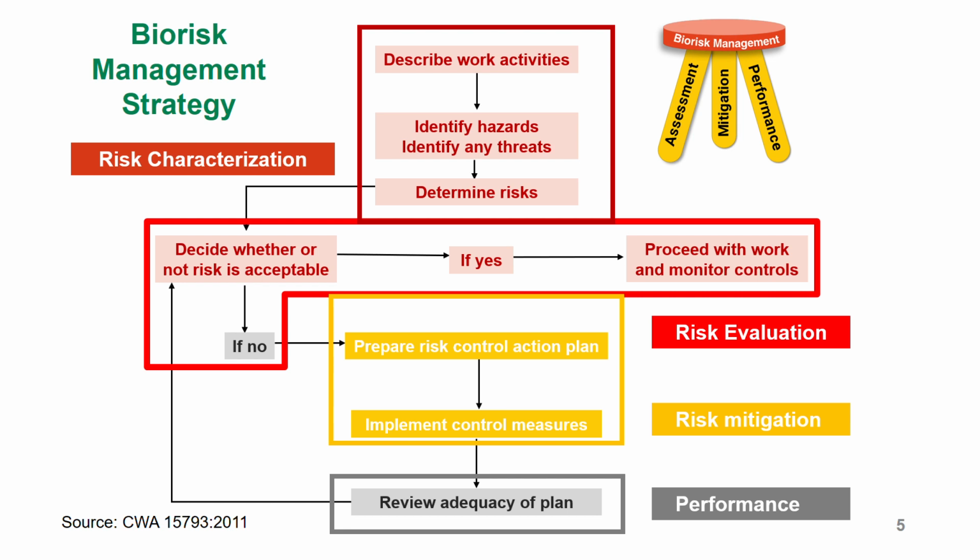So now you're monitoring the control measures that you put up, the class 3, maybe the biosafety cabinet you bought, and you're checking the facilities, if they're working okay, and the additional ones that you put up. So you're checking the vaccination, is it working, or anything else that you implemented. Maybe if you realize that there was a human factor, at this point you're checking, is the training working? Are the procedures that you put up so that people understand what they're doing and standardize what they're doing working? So you continuously monitor that as well.